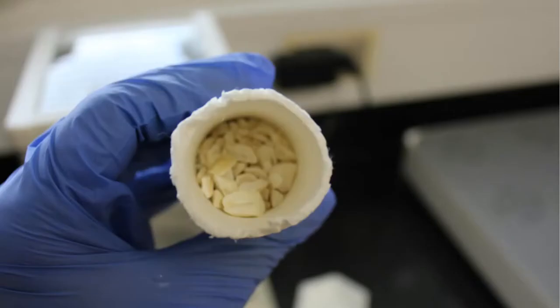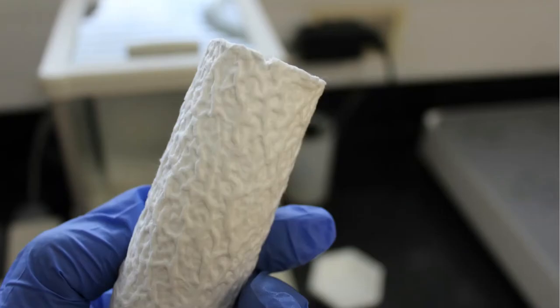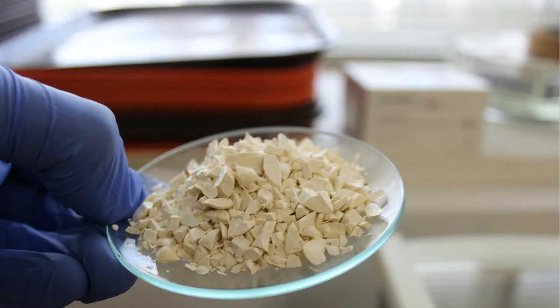Looking through the thimble and the nuts, this is what they ended up looking like in the very end of the process. Again, rip. I see some fibers that are torn from the top. There's one on that side, and here's another small one on this side. I can see that up here at the very top. I see that jagged little edge. And I dumped all of the nuts out onto a watch glass so that way you can at least take a look at what the peanuts looked like in the very end. And this is what they were. Very whitish, chalky looking. The picture just really doesn't do it justice.